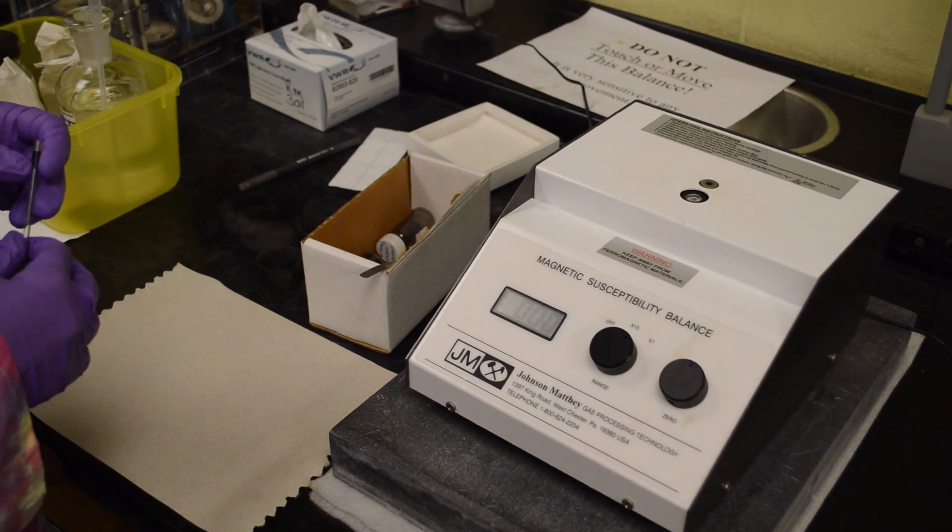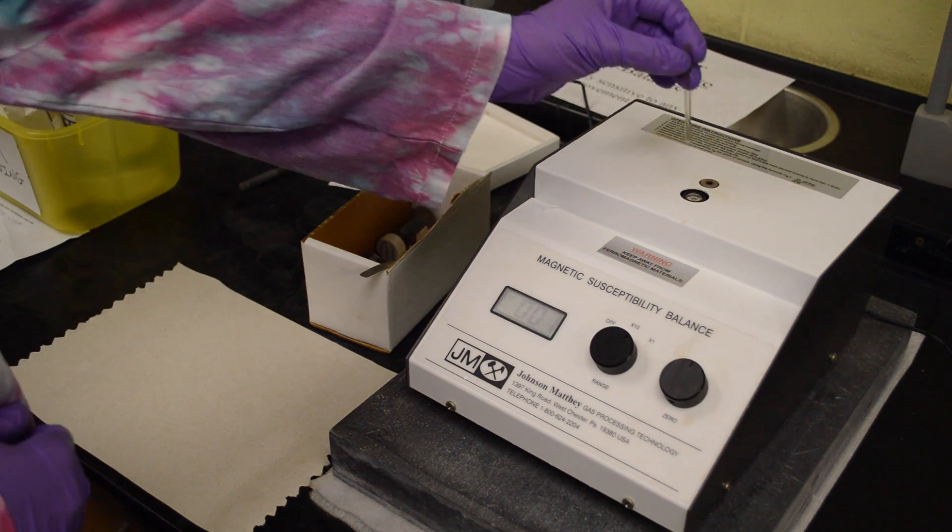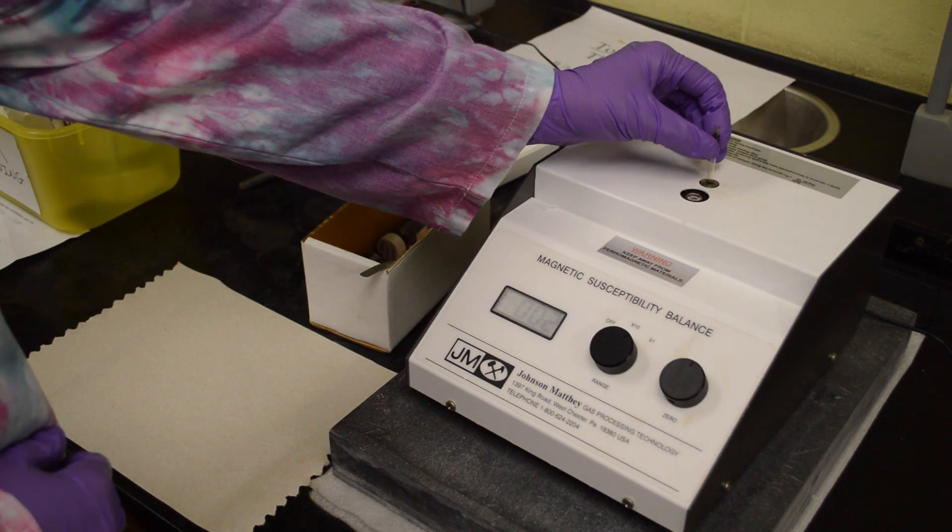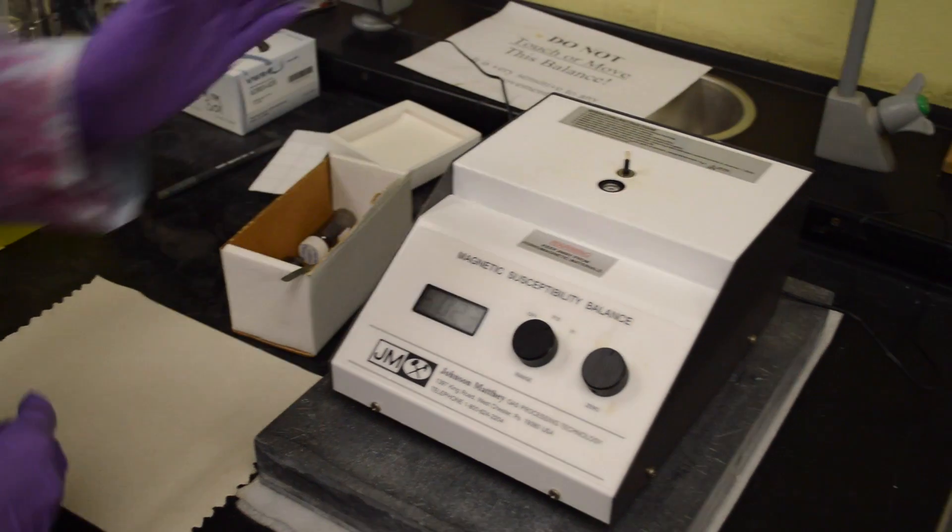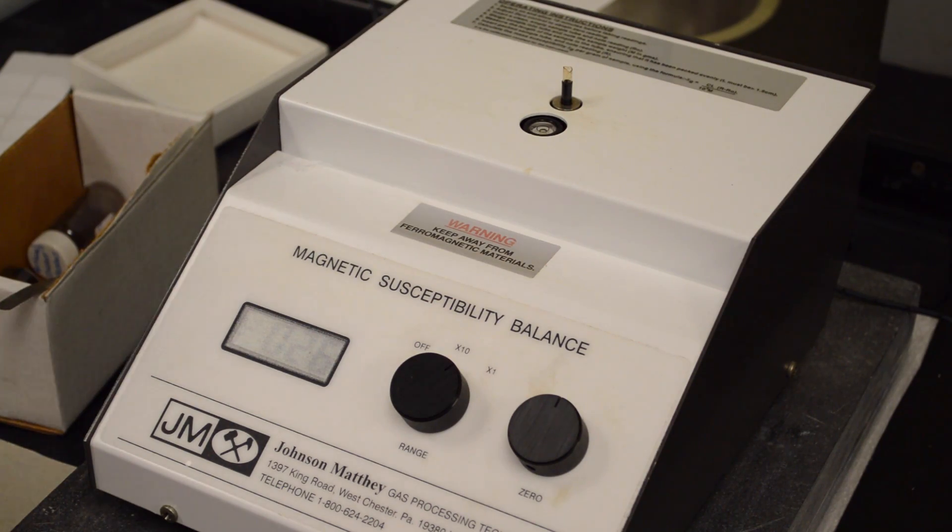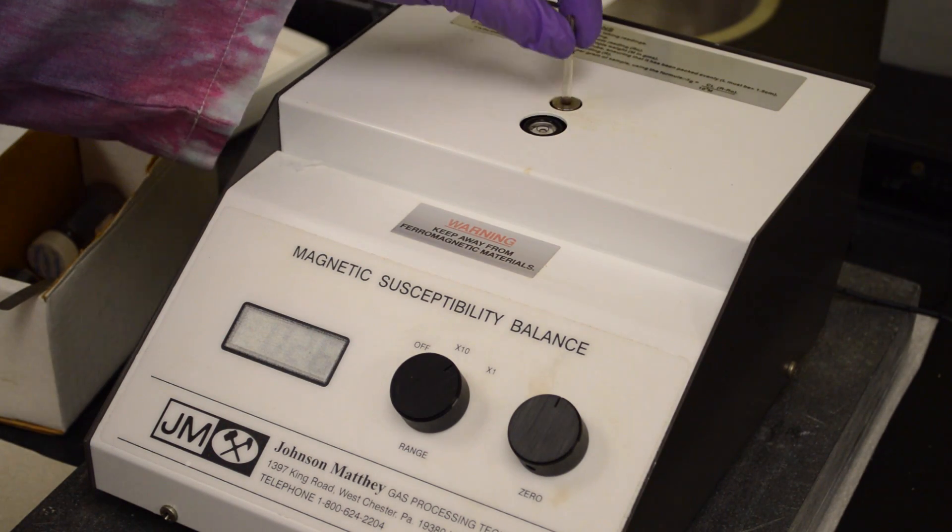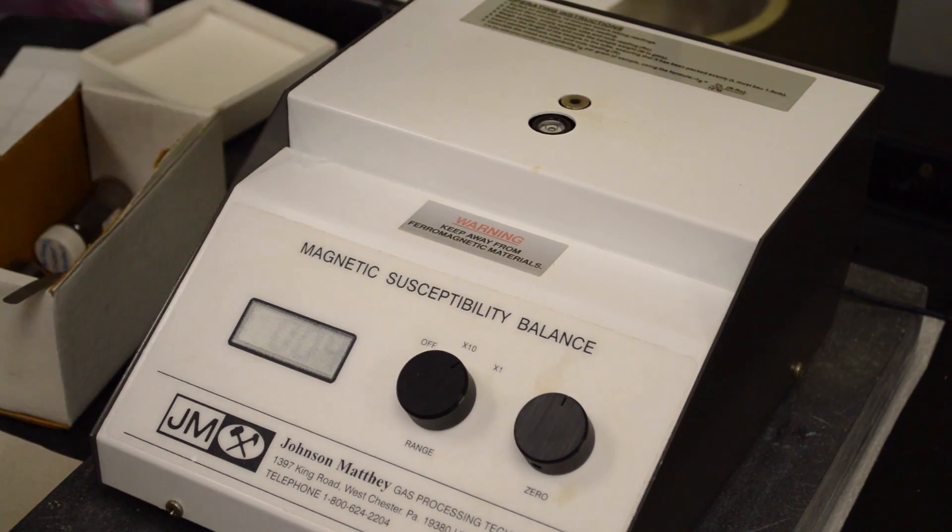Place the empty tube in the tube guide and record the reading, which would be R0. Then remove the empty tube and weigh it carefully on a balance to the nearest milligram and record the mass of the empty tube in grams.